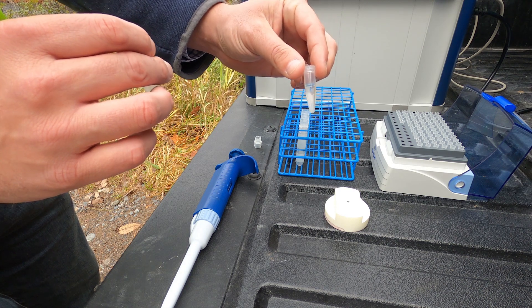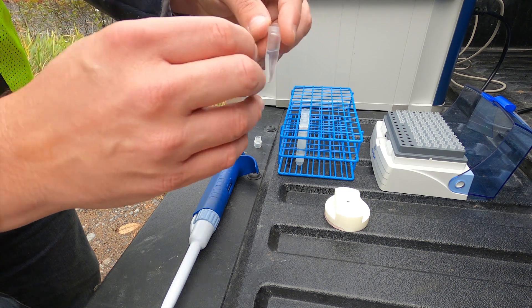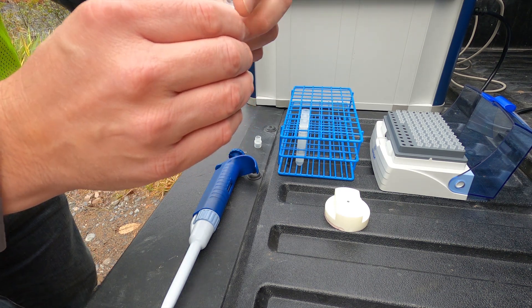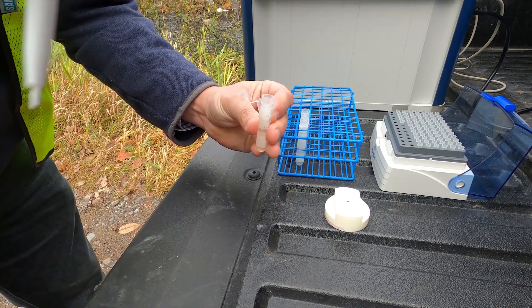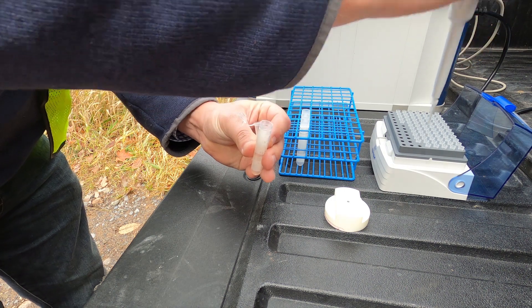Here's our gallium internal standard. We will pipette 10 microliters of the gallium directly into our water sample.